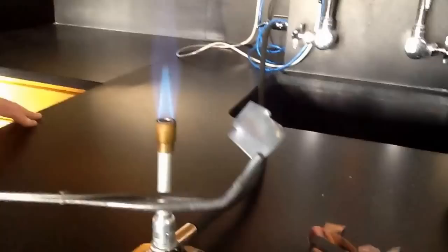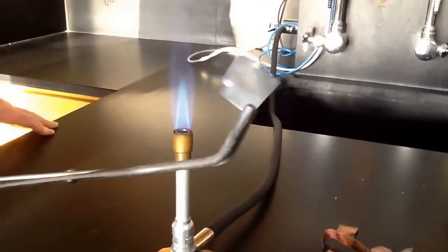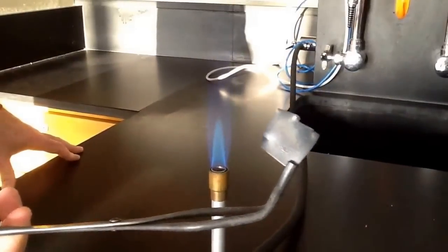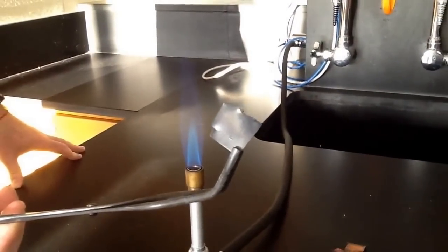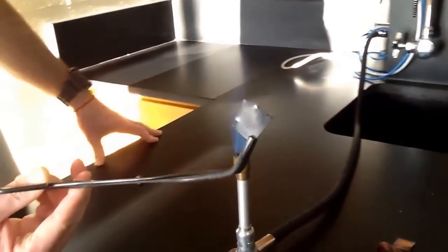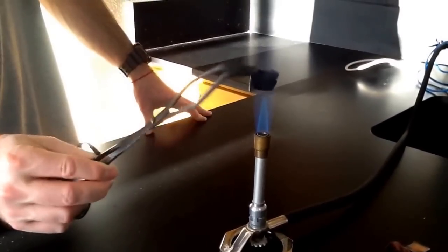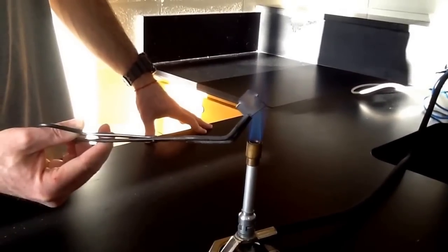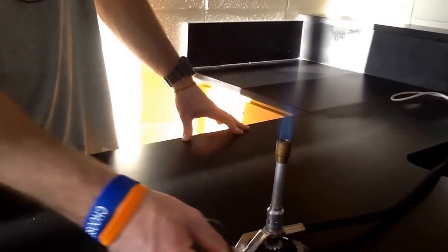All right. The other way we know a chemical reaction occurs now is that we have our copper, which is a nice brownish orange color. You can see now it has that black coating, which is copper oxide that's formed on the outside. So by heating up the copper in the flame, we've accelerated the rate at which copper reacts with the oxygen. All right. So that one, since we're dealing with 2 elements, copper and oxygen, combining into one, that is going to be a combination or a synthesis reaction.